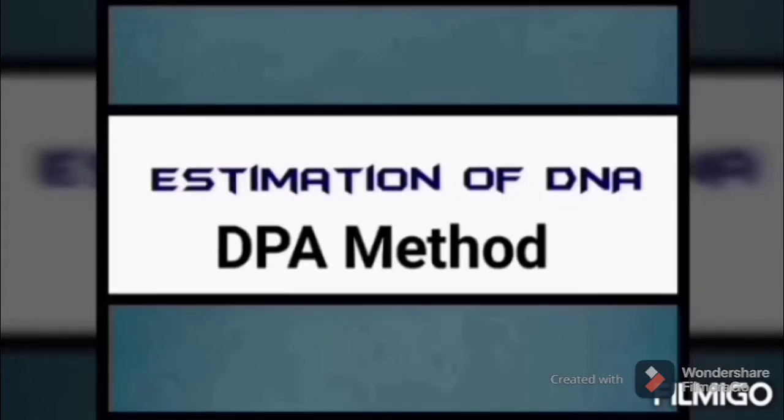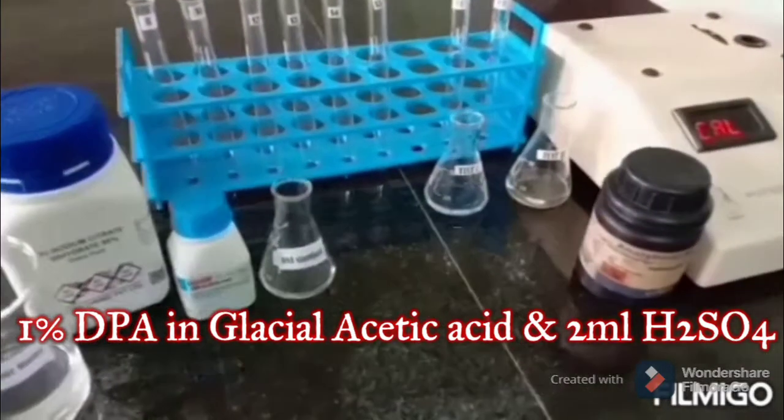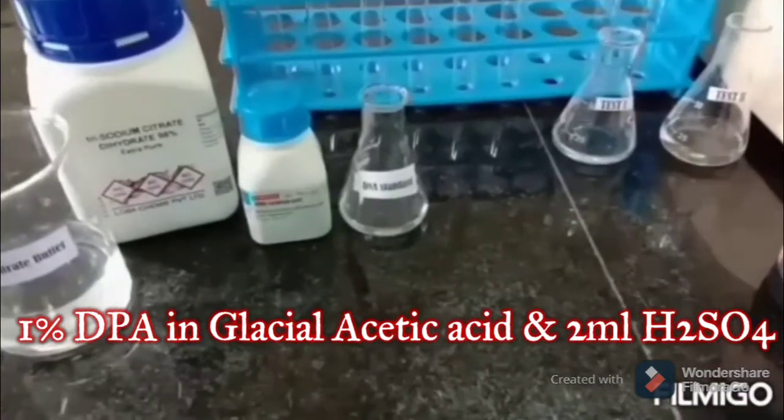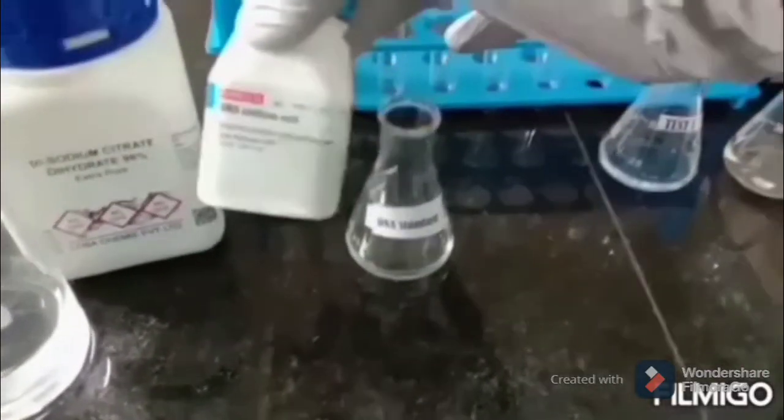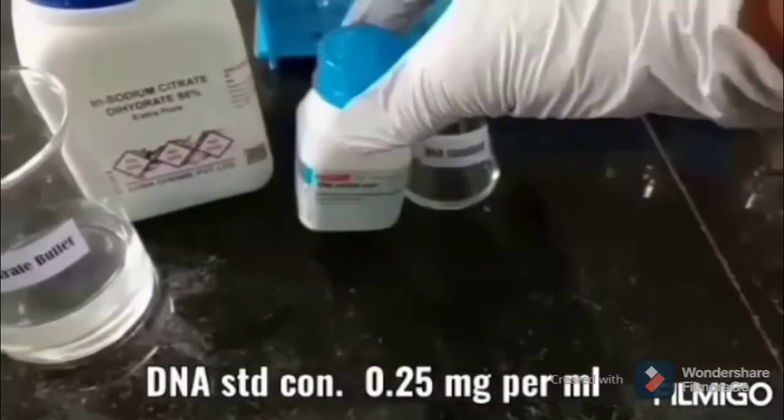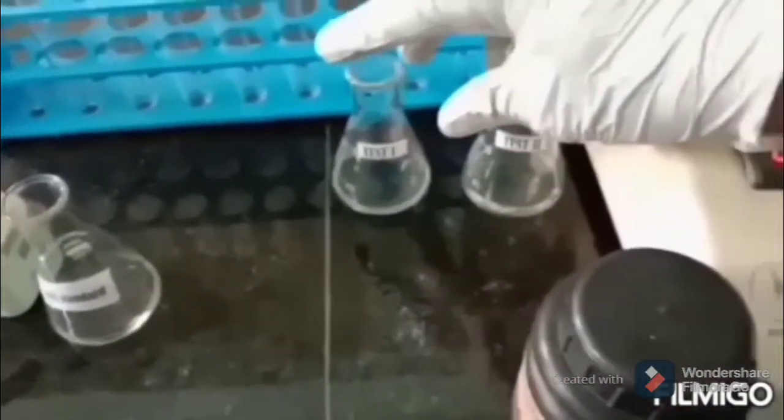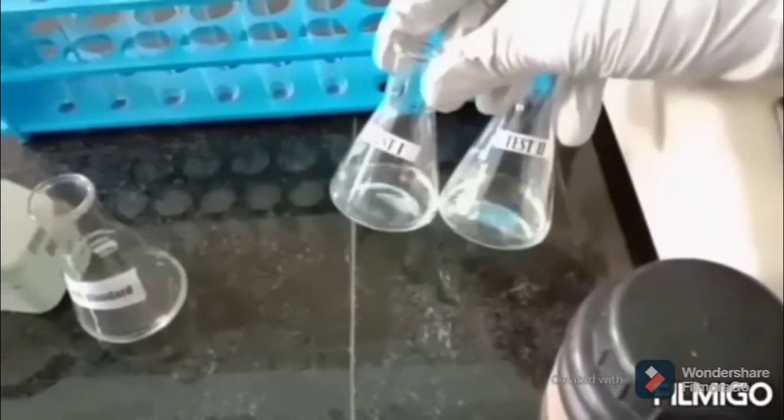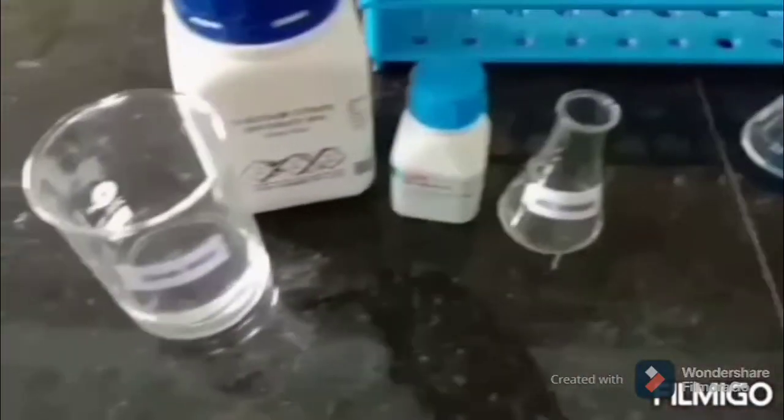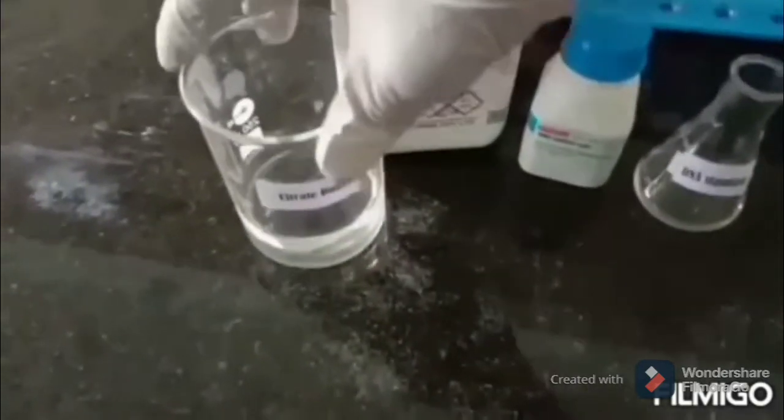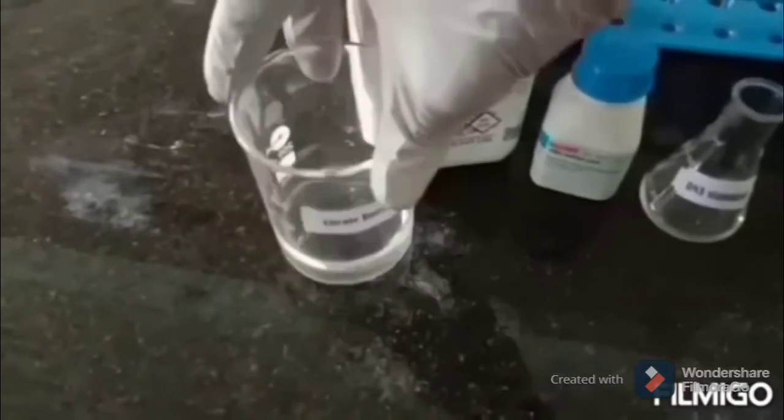Quantitative estimation of DNA by diphenylamine method. The reagents required are: diphenylamine reagent, a standard DNA solution having concentration of 0.25 milligram per ml, which is used to make serial dilution of standards; unknown concentrations of DNA, the test solutions, the concentration of which are to be found out; then saline citrate buffer, which is prepared using sodium chloride and sodium citrate dissolved in distilled water and pH adjusted to 7.